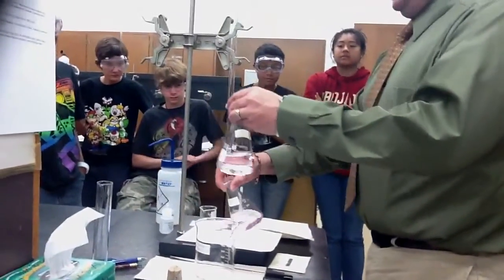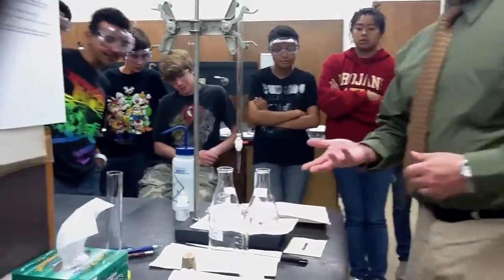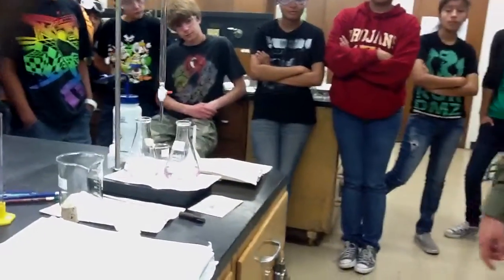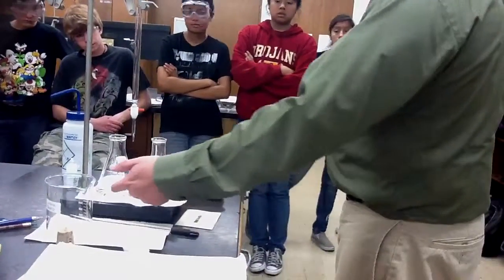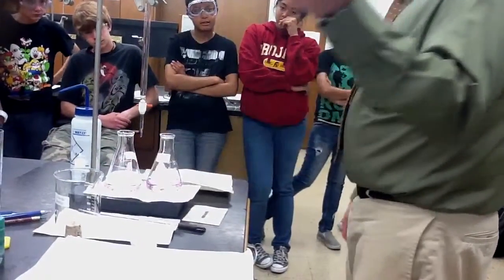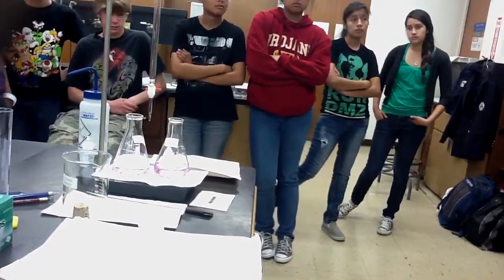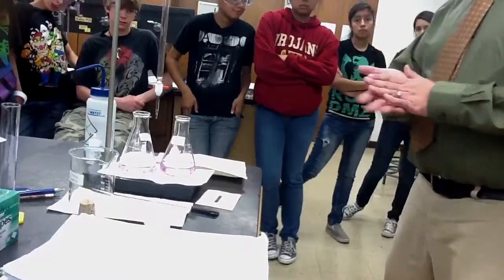Now, compare this one to this one. It's not that bad. This one here, the one that they started in the beginning, it was kind of like this, but something's been happening to this thing here. Does it look the same color as this one? Does it look the same color as that one? It's actually gone paler. It's more pale. This is darker than this one here, but it's been sitting down here. Can anyone explain why? What do you guys think? How come it's lightening up, being paler? It's reversing. What is reversing?